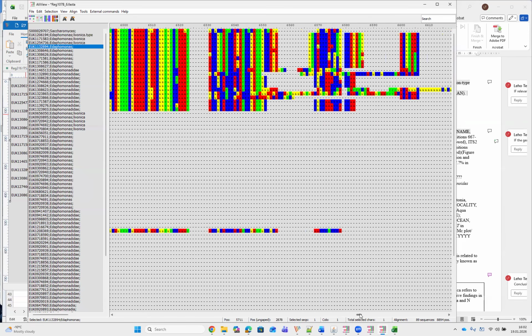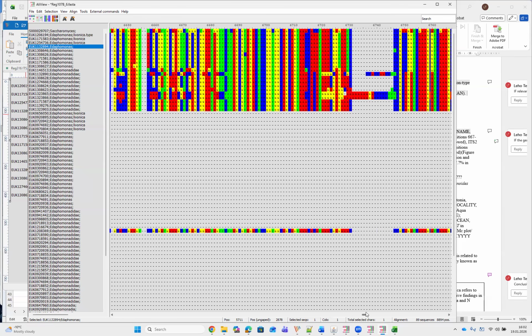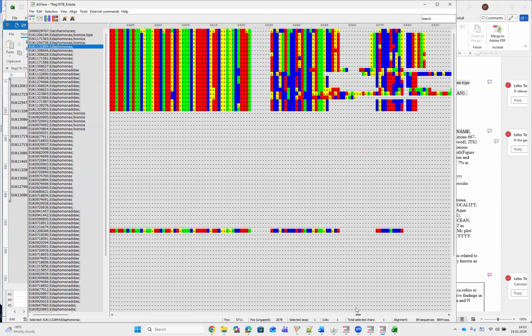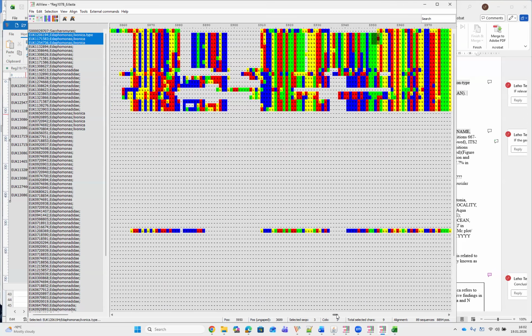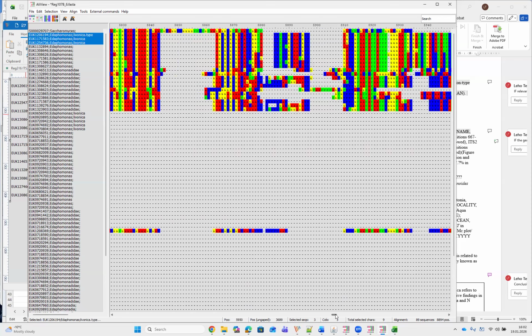Okay, now we are slightly moving outside this targeted first 1000 nucleotides. So let's go back and see some of the places that we initially considered. Okay, so here is also one occasion where we have this polymorphism within our species. This is quite rare in large subunit and small subunit, and most often it is some kind of sequencing error.